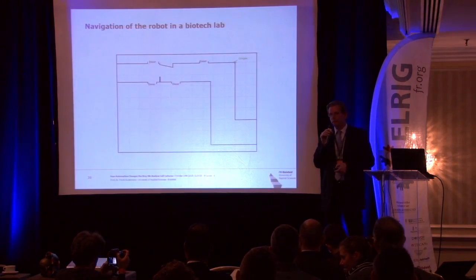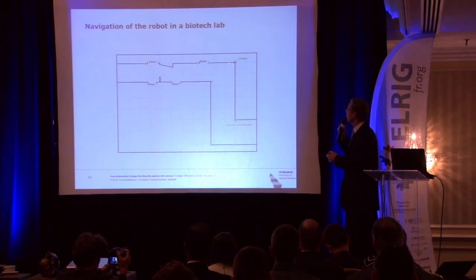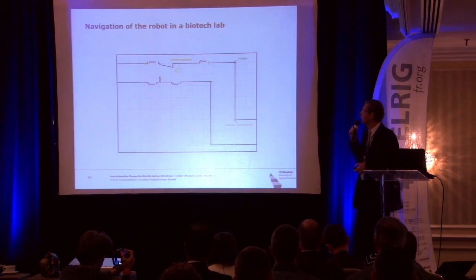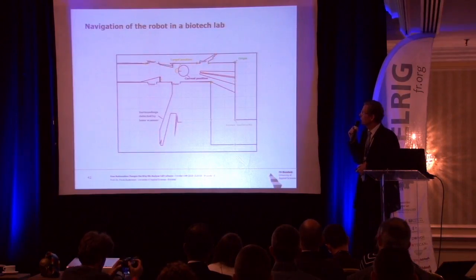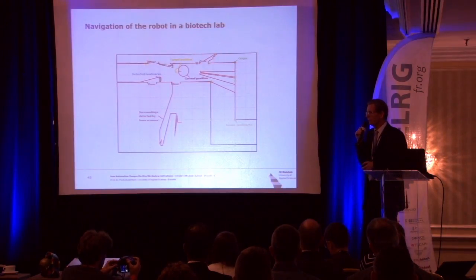The orientation or the navigation was tested in a corridor first. So we have here the origin. Then we have known marks, so we put some reflector bars on the walls, and told the robot to move a little bit, so we have the current position and then the target position, and this is what the robot actually sees. So this is the result of the laser scanning procedure, and here you see the walls.